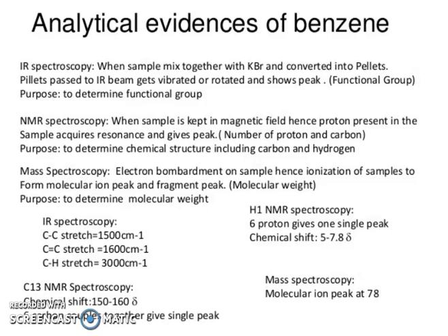Mass spectroscopy: electron bombardment on the sample, hence ionization of the sample to form molecular ion peak and fragment peaks. So the purpose is to determine molecular weight.